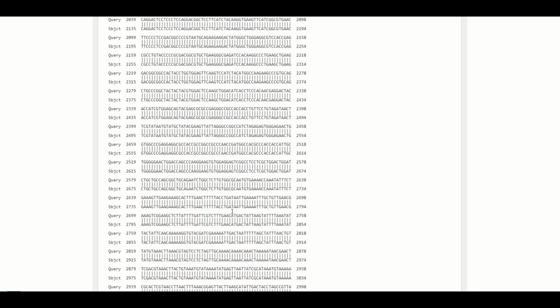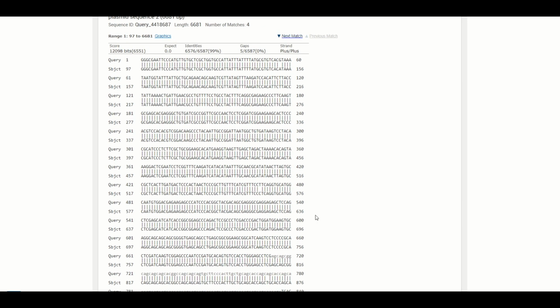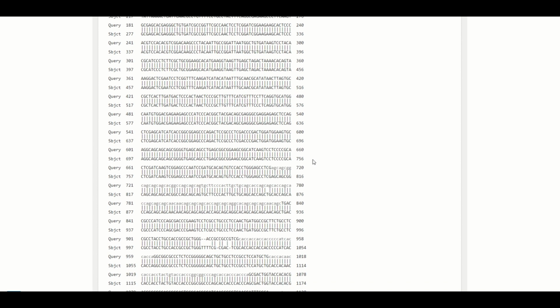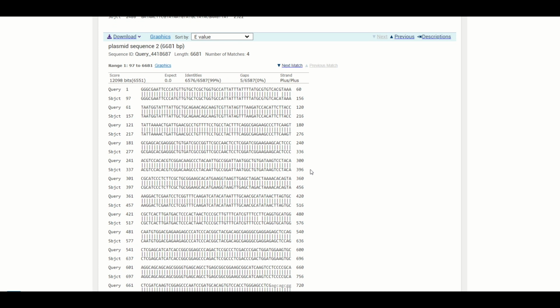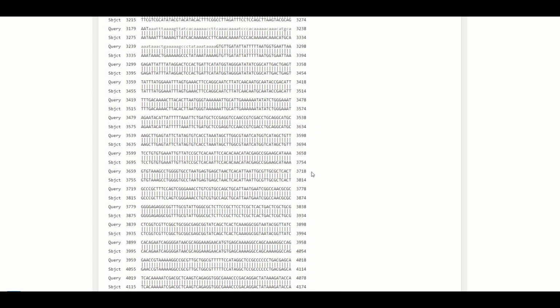Now, mismatches are really hard to see in here, right? These ones are a little bit easier to see, but if you have a single point mutation, there's one in this line. Do you see it? Takes a while. It's right there. So this works, but it's obviously very rudimentary feeling compared to the other two methods. But this is how we did it for years, a long time ago.